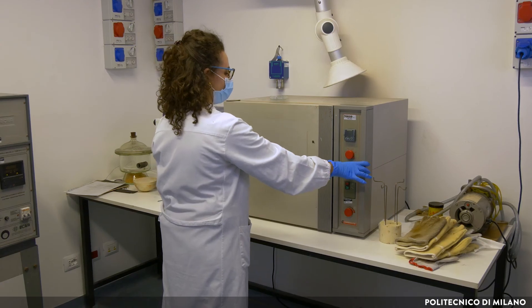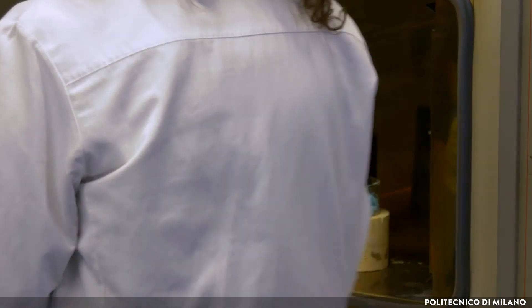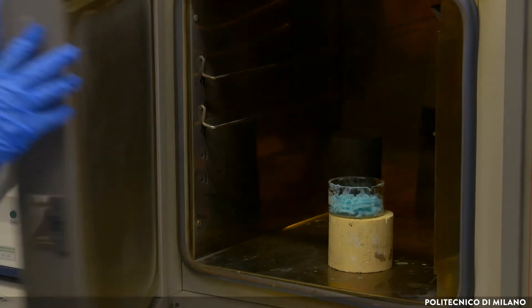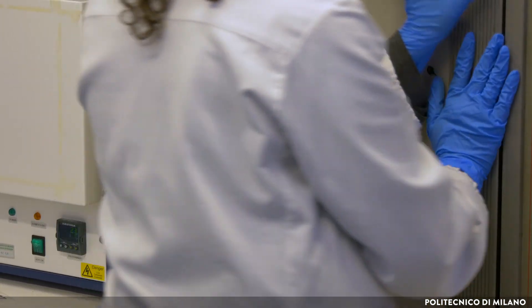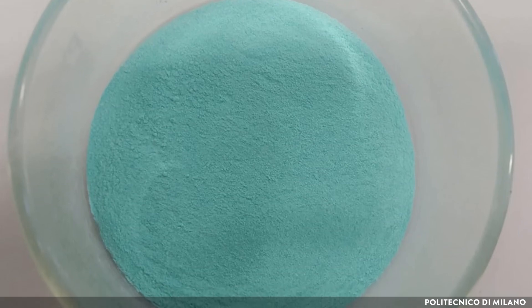The following step is drying. The solid is put in an oven at low temperature, around 80 degrees Celsius, for one night. In this way, all the solvent evaporates from the solid.